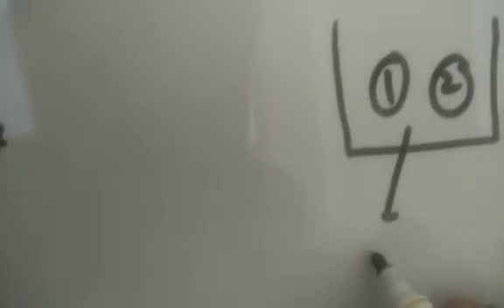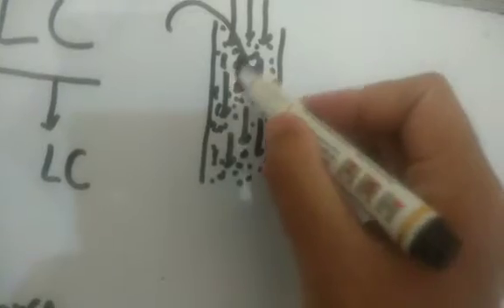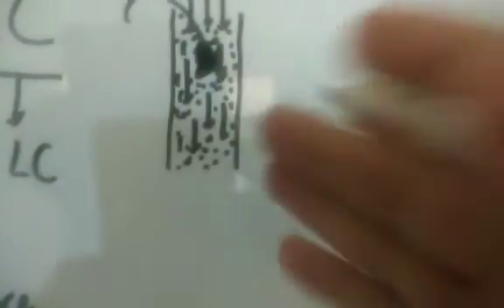So what does that mean? That means if you have two components, let us say 1 and 2, and let us say components are polar. I will write P1 has more polarity than P2. Both have polarity, and as our adsorbent is polar, once we insert our sample here, they will stick more to the column.